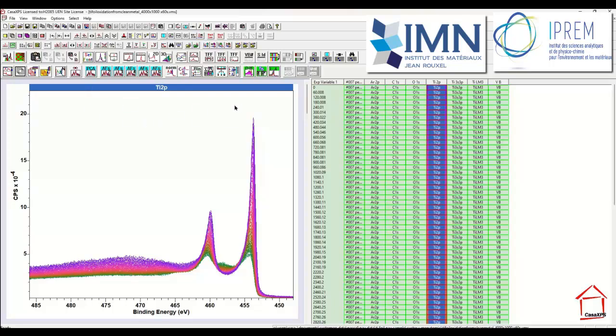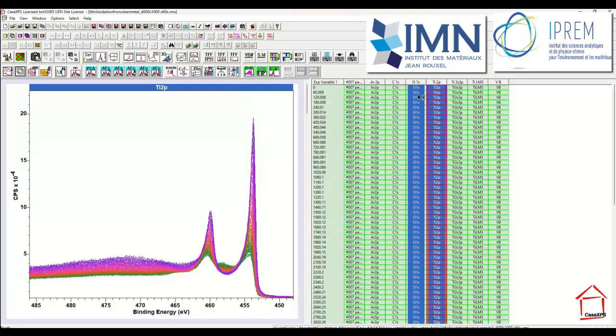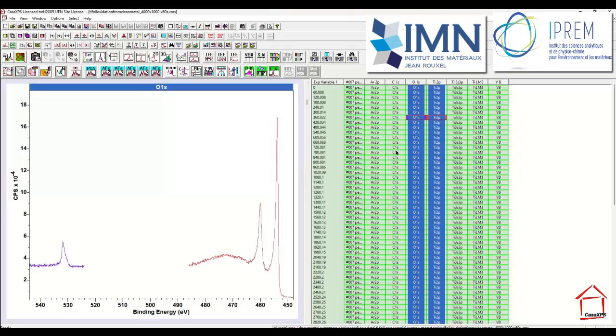to analyze the data. And the way you do this is to make a selection of all of the VAMAS blocks that are of interest, then display in the left hand side display tiles that contain the two spectra of interest on a row by row basis, and that's achieved using the tile by row toolbar button. So make a selection and then apply this button, and we end up with a scroll list that contains all of these spectra arranged with the oxygen and the titanium according to the experimental variable.